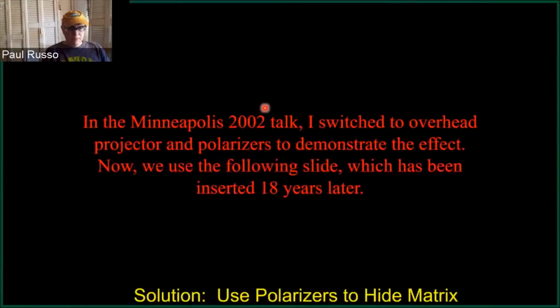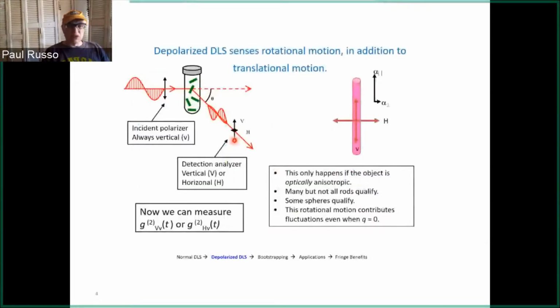This is a slide I just inserted this morning. Can you see the thing rotating? Yes. Awesome. That's a rod rotating between cross polars.